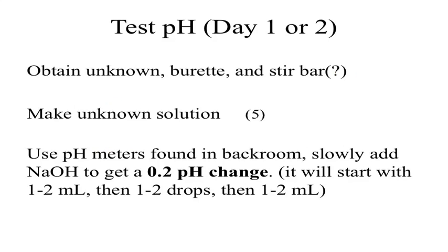You'll then move to using the pH meters in the back room. Now that I think about this, let me check, make sure we actually have those set up. Yes, we do have the pH meters ready to go, so you are good to use those today. You will then go through, set up your burette. All of them should be set and ready to go.